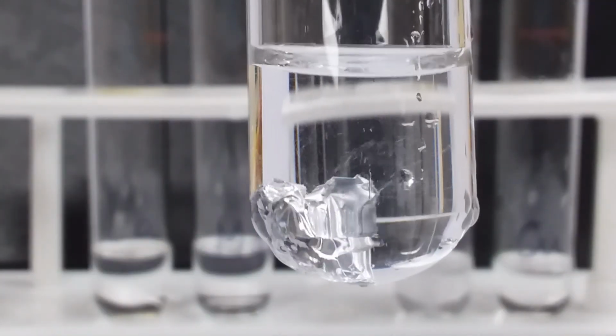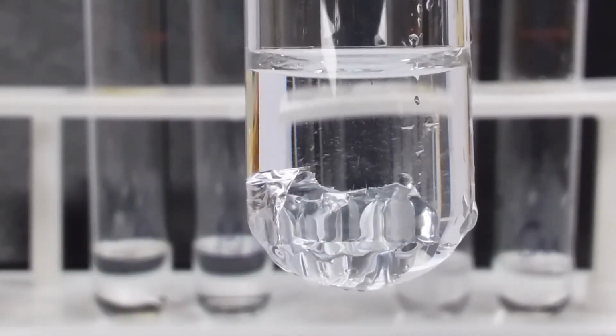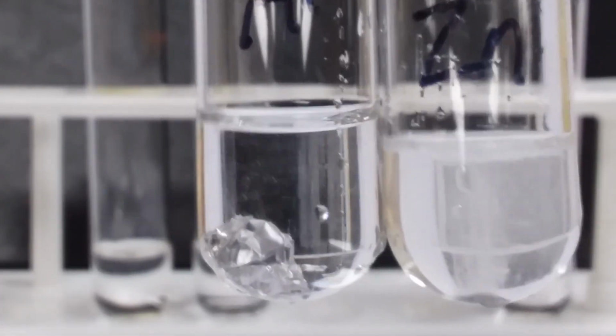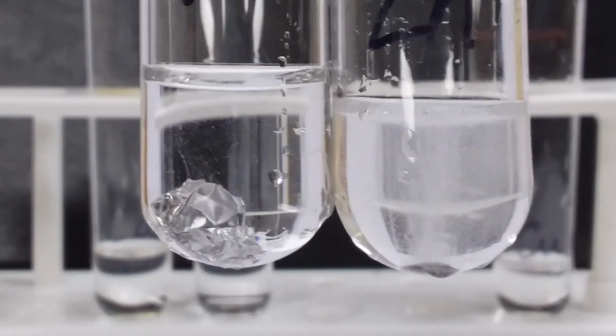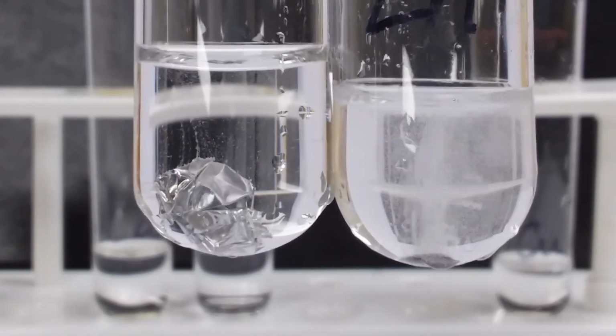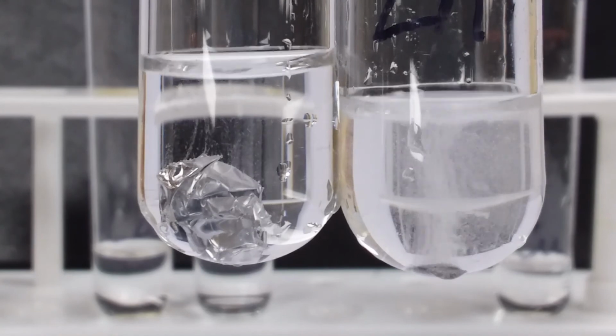So now we have a comparison to be made between the aluminum and the zinc. Zinc is still going. Zinc is on the right side, aluminum is on the left.